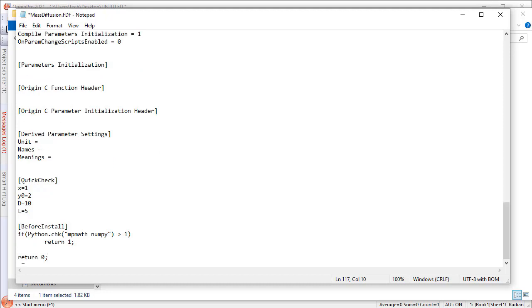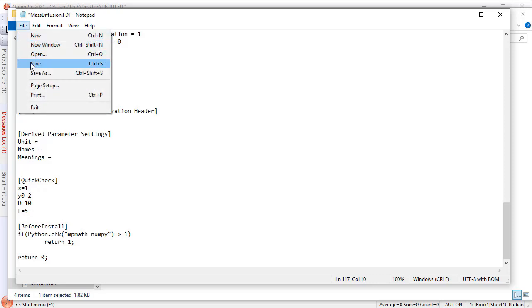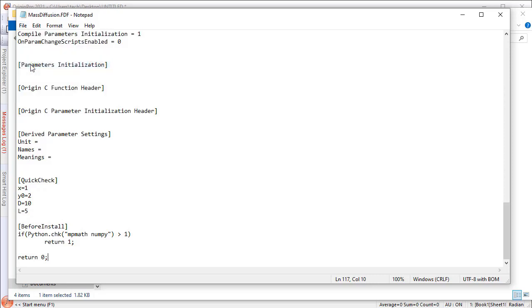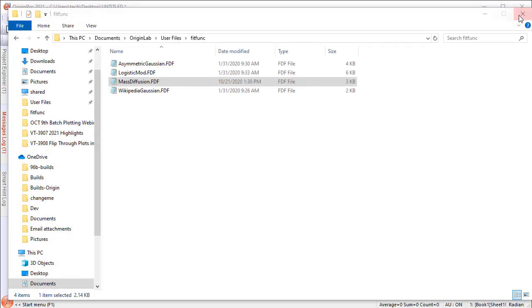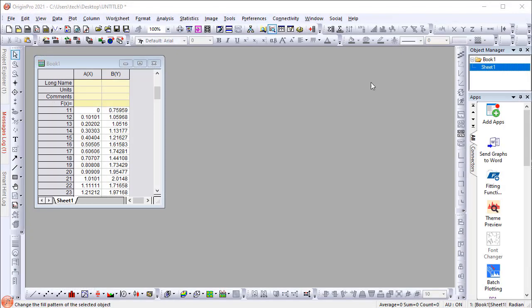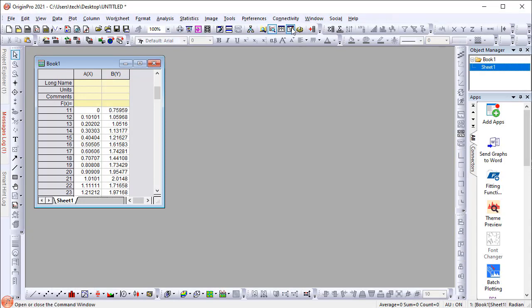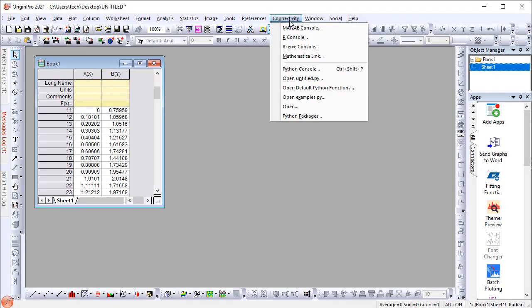Now save the file. To manually install the packages, go to the Connectivity menu and select Python Packages.